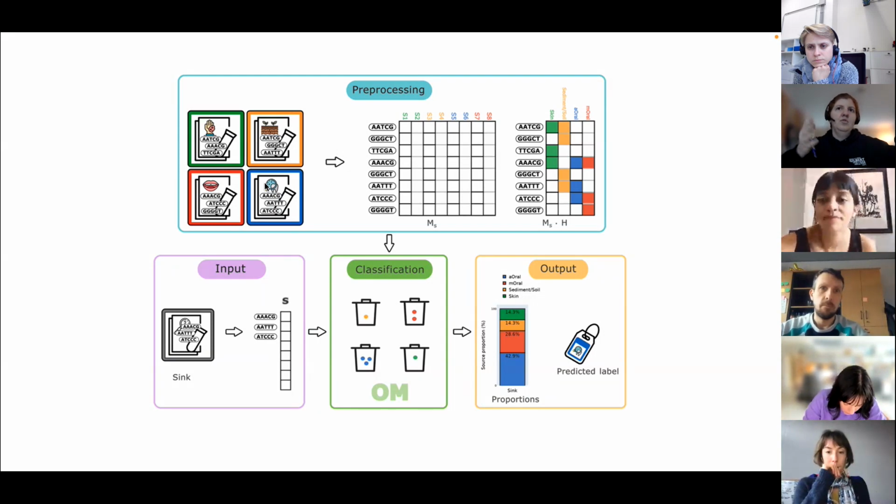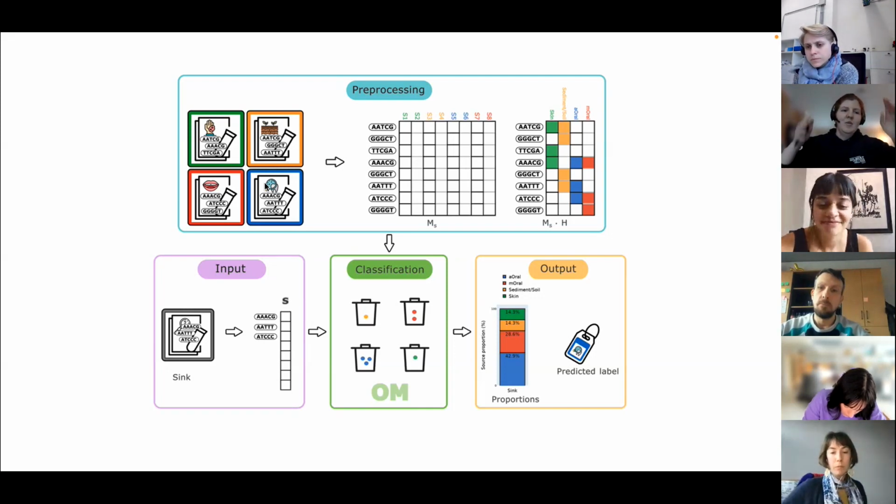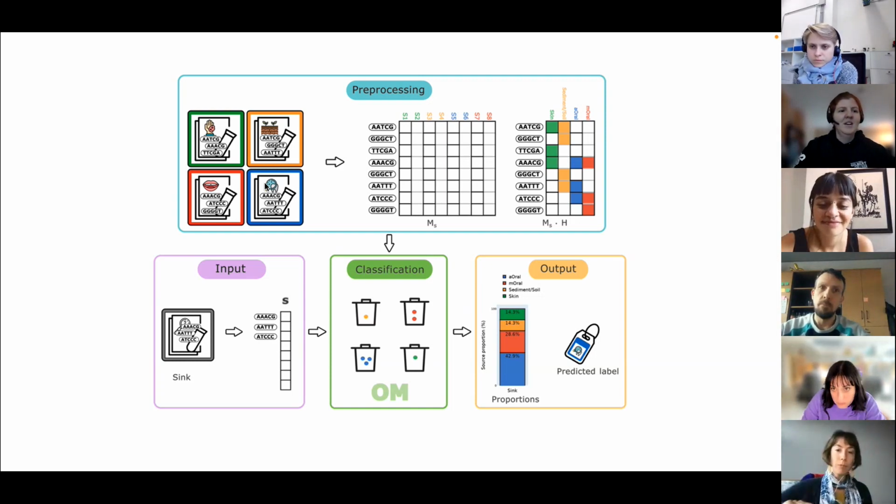And then could you also transfer that information into the k-mer broom so that you could remove, for example, if something looked like oral or skin and you're like, no, I just want fecal microbiome, then yeah. Yeah, it's what I said.